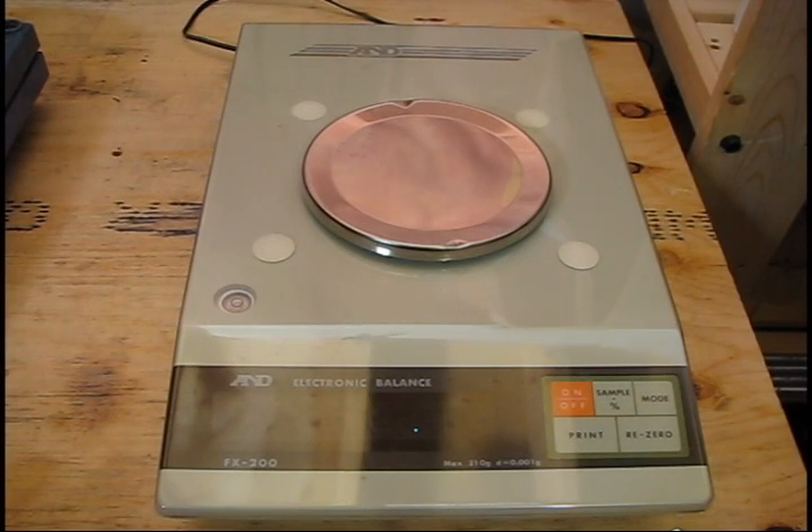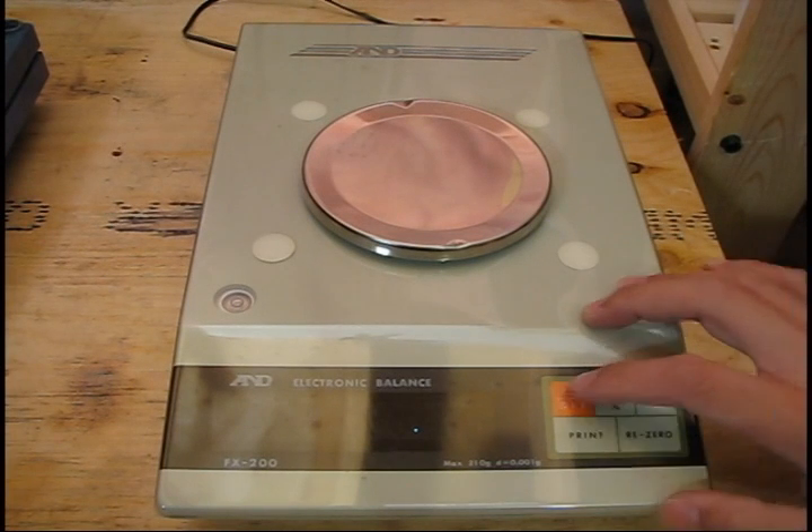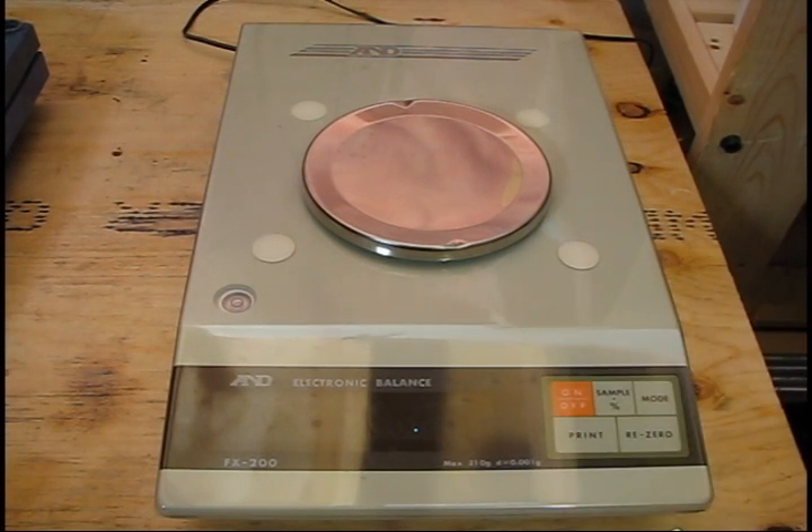I wanted to address a couple of points. One was how to use one of these balances, assuming it's already been set up and calibrated — this is mainly for the undergraduate chemistry students. I also wanted to address a pet peeve of mine that I've seen undergrads, graduates, and even postdocs do themselves. This is not that hard a mistake to make and overlook, so I'll get to that later.